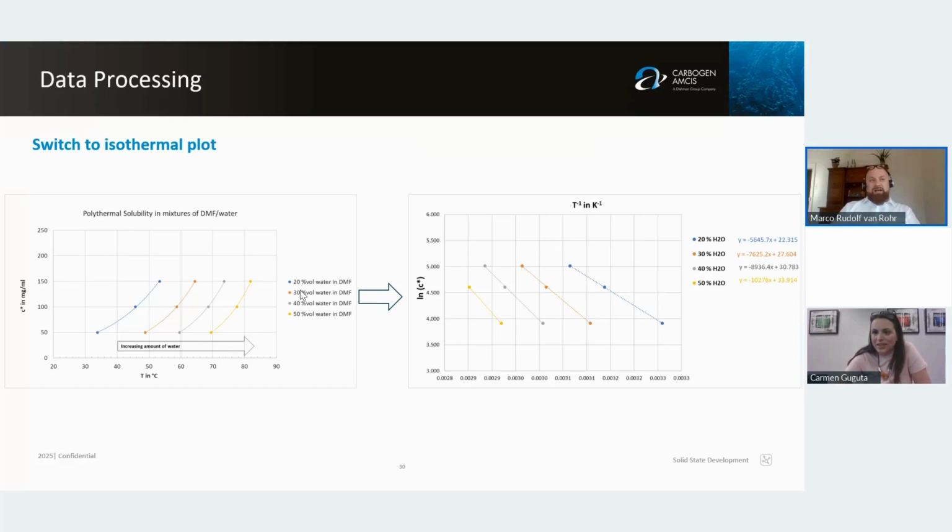And I would assume that a film or coating is something linked with cooling down or nucleation. If I fill in a powder and warm up and I have formation of a film, then my problem is a whole different one. Yes. If my material melts in the measurement or something like that.